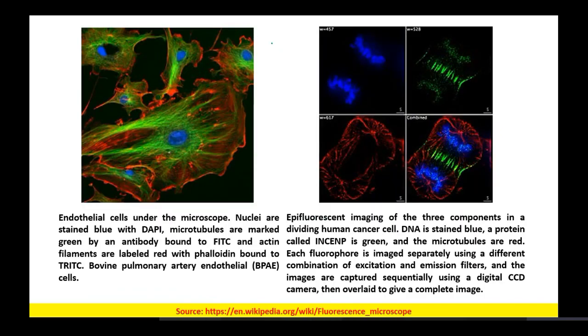Suppose there is an excitation filter EX1 and an emission filter EM1. Say for example this combination is working for the blue channel.